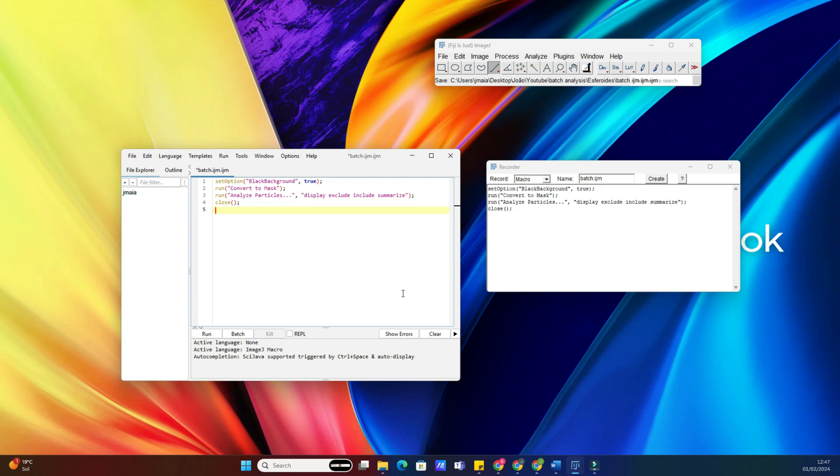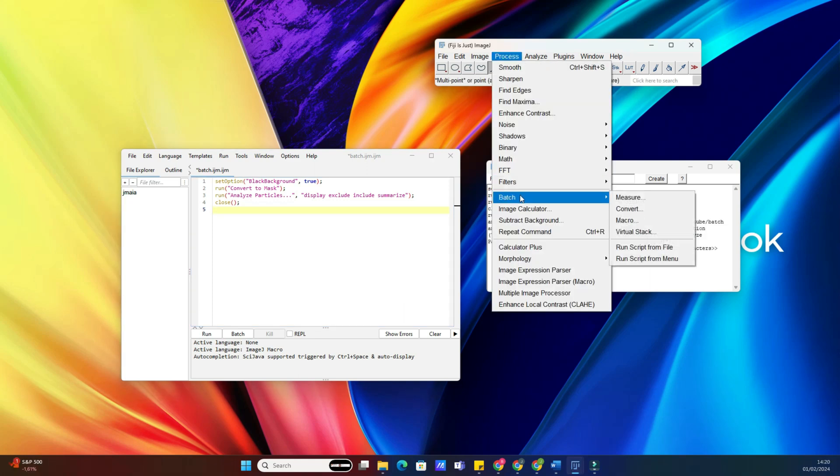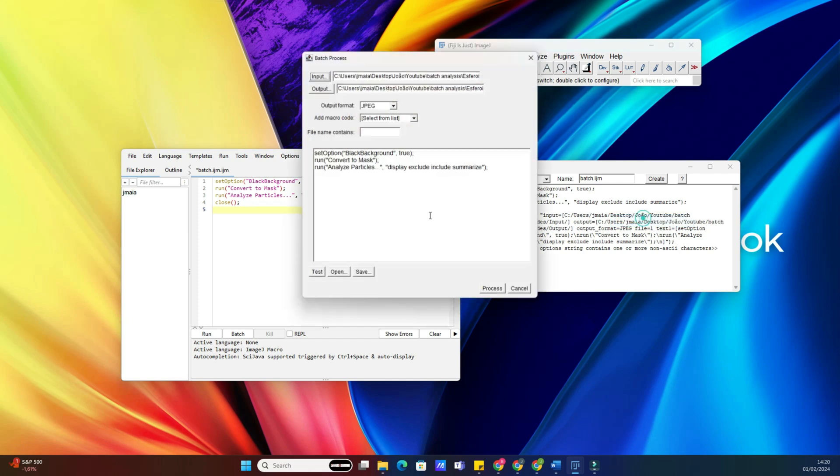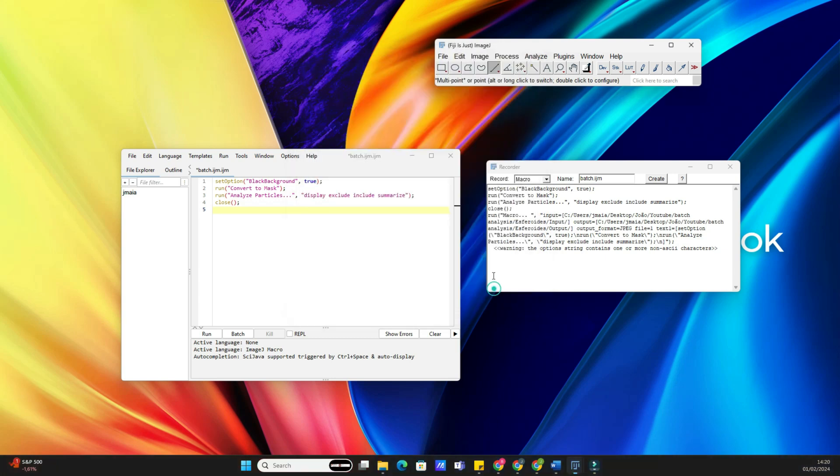Once the batch analysis is complete, it's essential to review the results. ImageJ typically saves the analyzed data or images in the output directory you specified. Take a moment to check the results and ensure everything looks good.